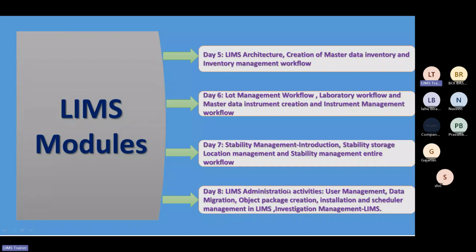Okay, for administration purpose, there is another course available, but for this course we have included administration activities that are related to LIMS software. Okay, and that also will be involved in the course in detail.